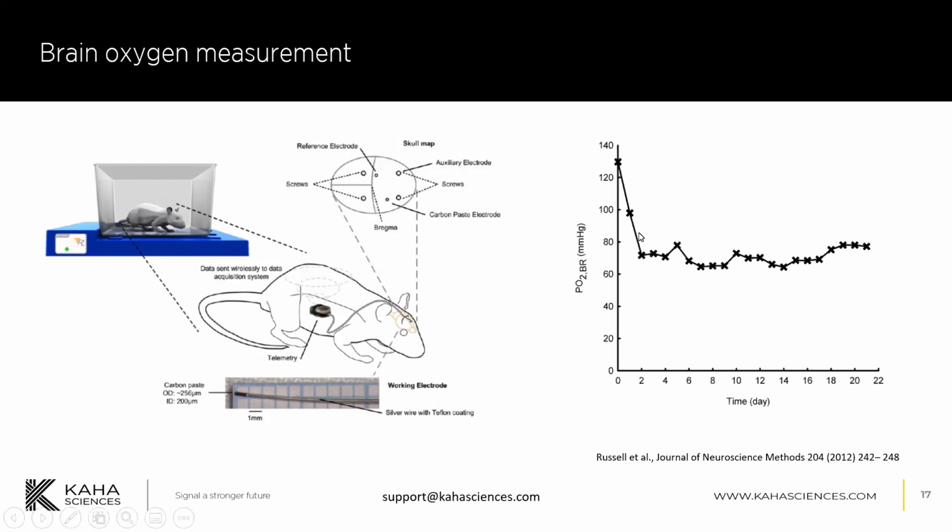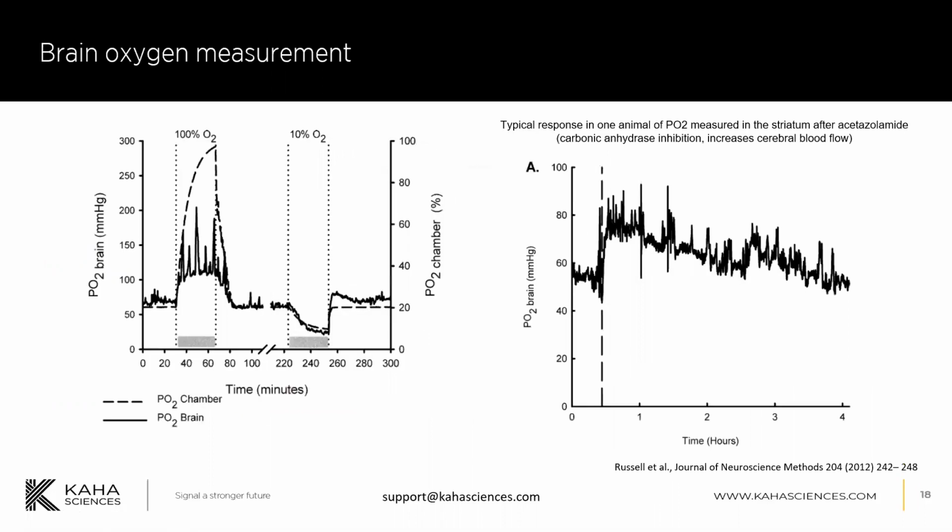If we look at the average tissue oxygen across the 3 weeks post-implantation, you can see that after the signal settles, it's nice and stable during the 3 weeks following surgery. And there's no reason it wouldn't continue for longer and up to the 12 weeks or more that was shown with the tethered animals.